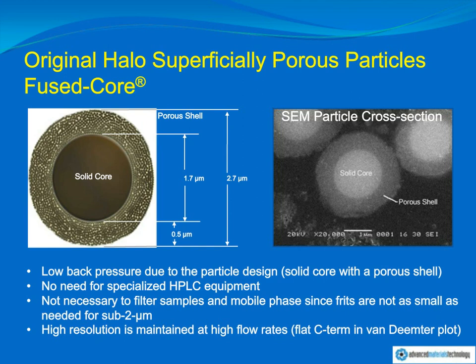And during the time in which so-called ultra-performance or ultra-high performance liquid chromatography was taking off in the marketplace, when instrumentation was relatively less common than it has become in the last couple of years, the superficially porous particles delivered the equivalent column efficiency and performance to the sub-2 micron particulate materials that were required for improving performance.